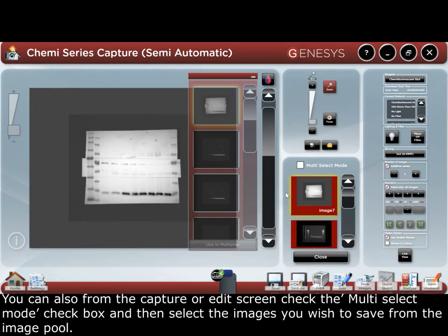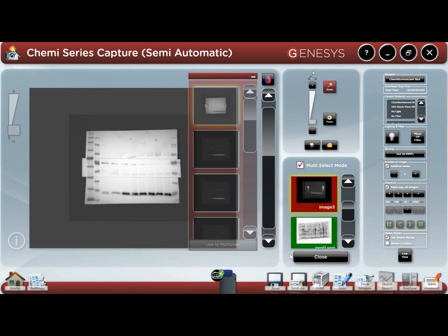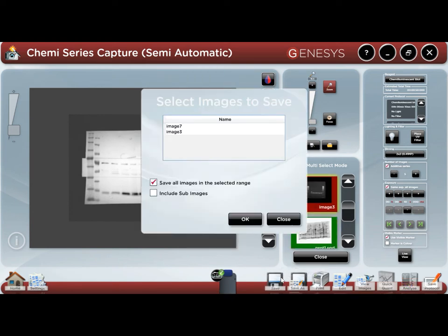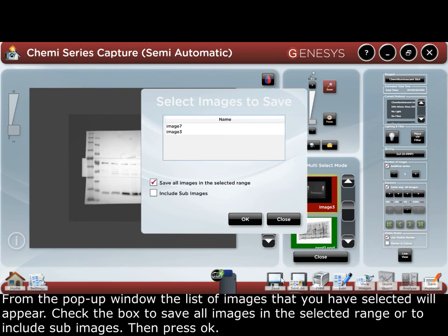You can also, from the capture or edit screen, check the multi-select mode checkbox and then select the images you wish to save from the image pool. From the pop-up window, the list of images that you have selected will appear. Check the box to save all images in the selected range or to include sub-images, then press OK.